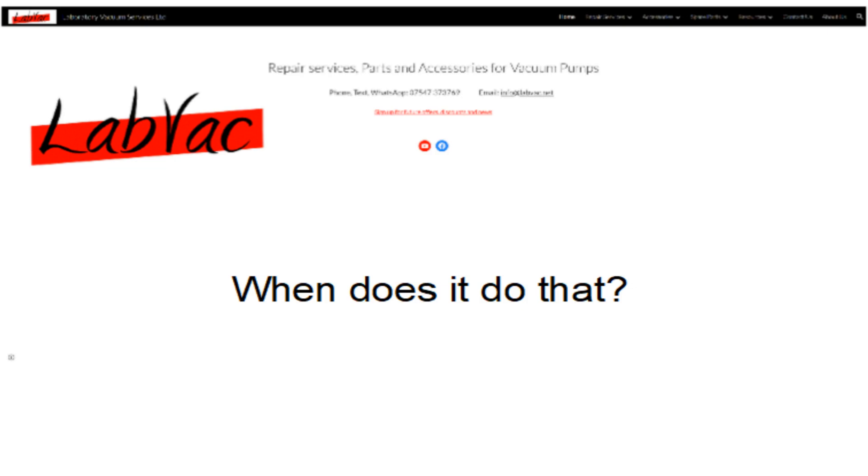So when does oil mist occur? It's a function of having a large amount of air flowing through the pump. It will occur when you first start the pump up, when it's pulling a lot of air out of whatever piece of apparatus is attached to it. It will also occur when gas ballast is employed, because that brings a lot of air rushing through the pump. And it can occur at any time during your process when the inlet pressure to the pump is raised for any other reason.